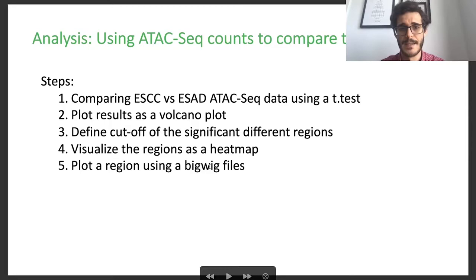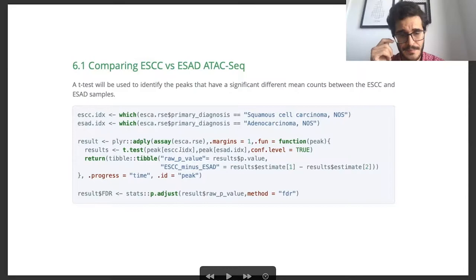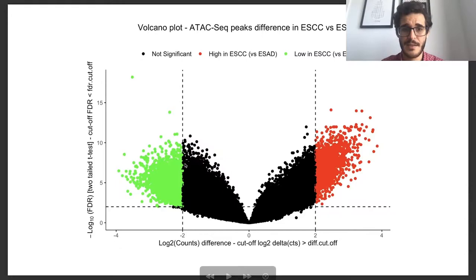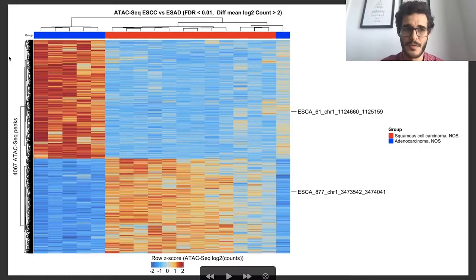I'm not going to cover the bigwig visualization code — I'll just show it. Another way you can do that is using some web browsers; I'll show an example later. Going through the code: for the t-test, you have the data, then you split into those two groups — squamous and adenal. Here it's indexing those in the matrix. Then you do a t-test over all the rows, all the peaks, and with those results you do a volcano plot. You get the ones that are significant and then do a heat map.